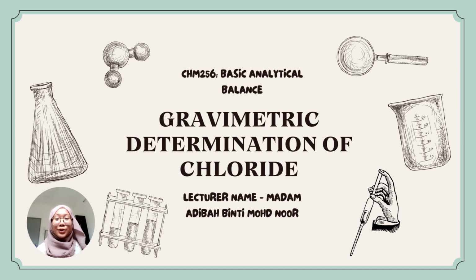Assalamualaikum and hi. Today I am with three other members. We present about gravimetric determination of chloride.